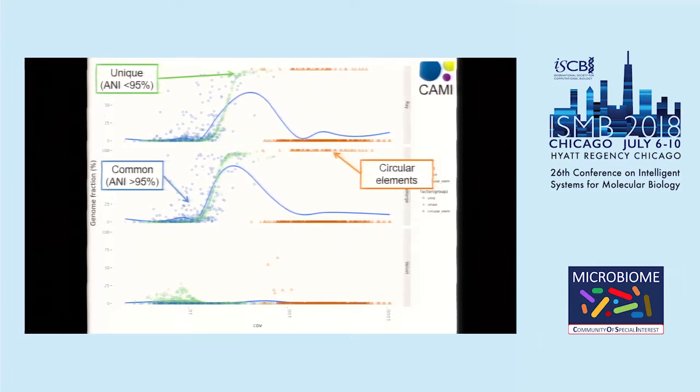So of course you don't assemble anything with very low abundance. The k-mer basically targets a particular coverage range, right? And if you only use a single k-mer for your assembly, then you only get part of the metagenome assembled.